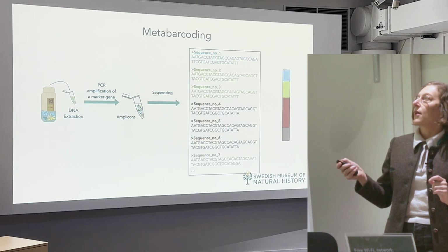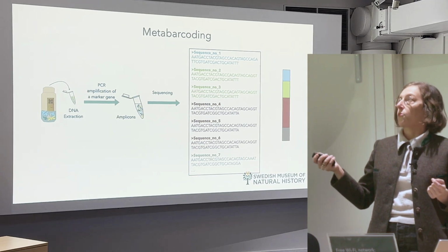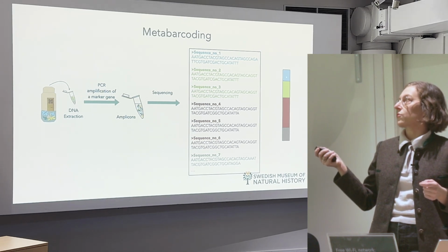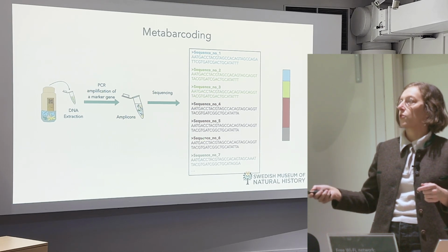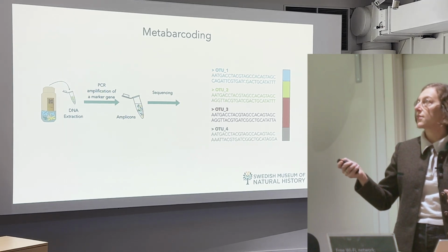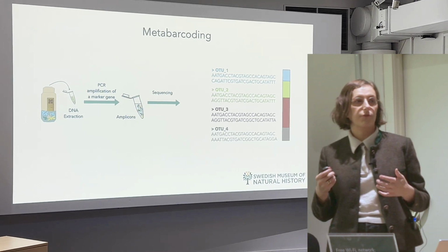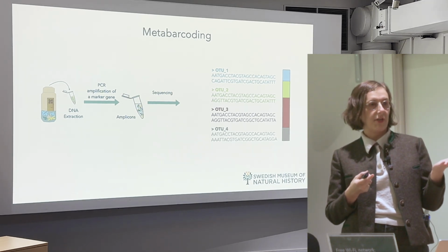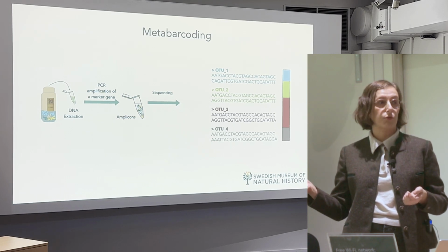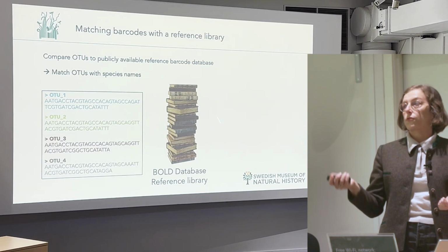So first we group them based on similarity. If those sequences are the same, they are probably the same, right? It's just the same sequence. That's all the information we have. So we merge them, and we can also say what the relative abundance of those different reads is. And if the sequences were the same for all the reads, they call this an OTU, Operational Taxonomic Unit, that Andrea mentioned. So it's a proxy for a species. Based on molecular data, we can assume that this is probably a species because it's different from this OTU and different from this OTU. And then to know what those OTUs are, we have to go to the reference library.